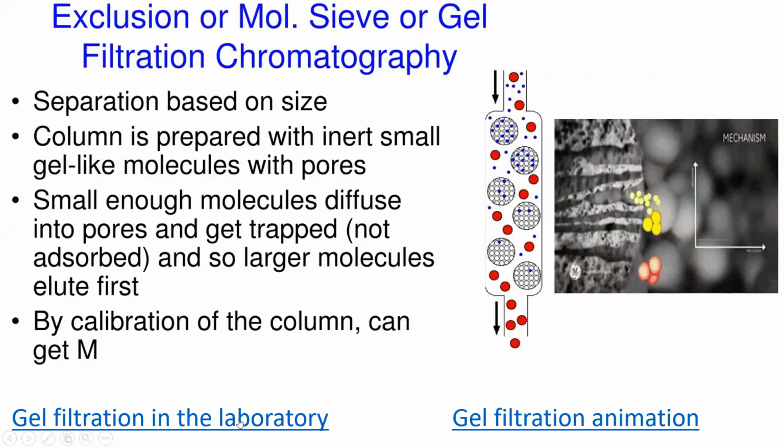So how is it done? You can look at this particular GIF image here. This is the polymer, and you will see the networking, the mesh inside. So these are the entry points for a protein molecule. This is just one bead, any biomolecule.